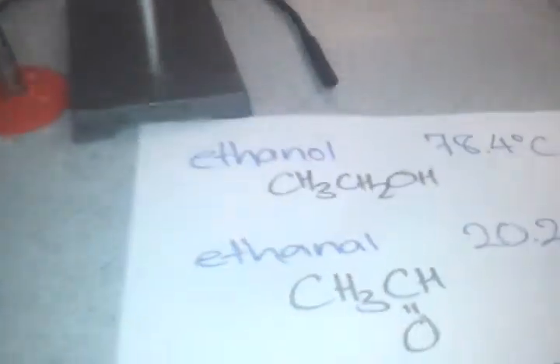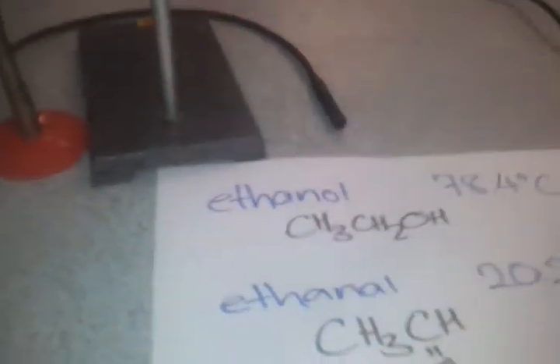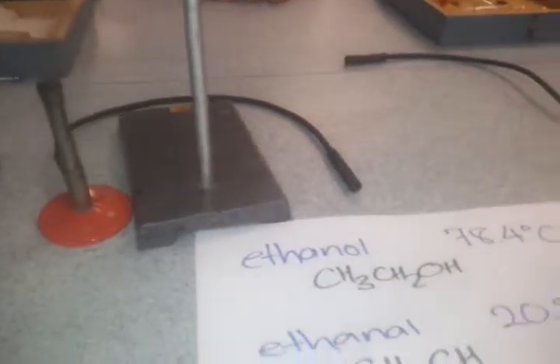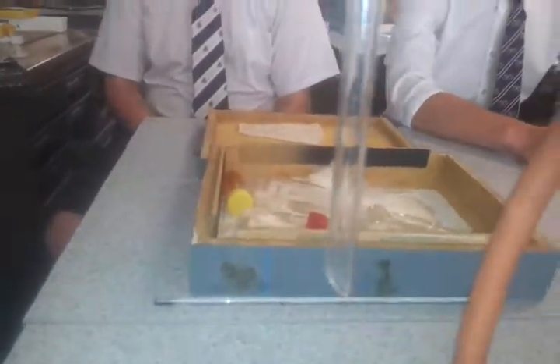They're used for different reasons, but the reason that we use these two setups is because our organic compounds, in this case we're going to pretend we're oxidising ethanol, are volatile, so they can turn into a gas quite easily. We don't want to lose them into the environment. We want to keep them in our flask or collect them in a vessel down here, coming out of the bottom of this. So we want to be able to collect our product, not lose it into the environment. And so that's why we have these systems.